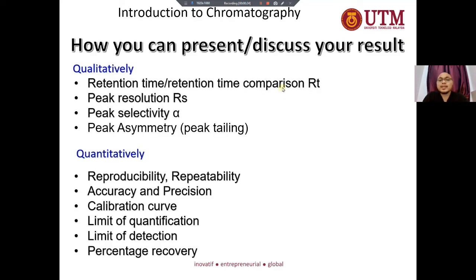Okay, the next one we will discuss is how you can present or discuss your results. If you are doing instrumentation analysis, you need to be able to discuss the result based on qualitative analysis and also quantitative analysis. In the qualitative analysis, you need to discuss the retention time, peak resolution, peak selectivity, and the peak asymmetry.